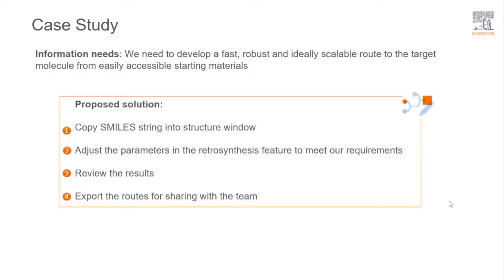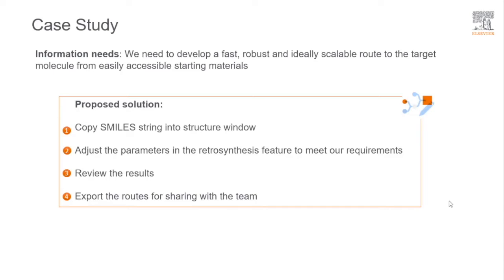For that, we need to first copy the SMILES string into the structure window of the Reaxys Predictive Retrosynthesis tool. Then adjust the parameters in the Retrosynthesis features to meet our requirements. Once we do that, we can hit the synthesis button and wait for almost 5 to 7 minutes to receive the results. Once we have the results, we can review them and share the routes with our team by exporting into various formats.